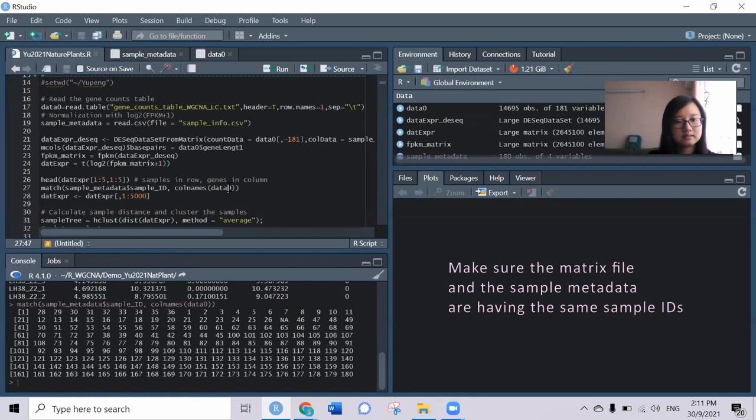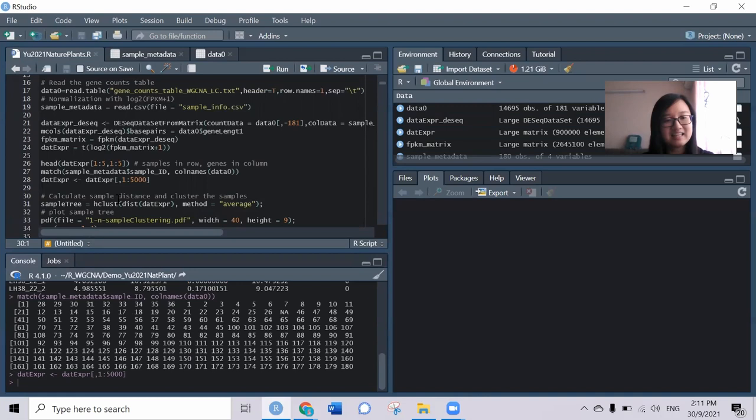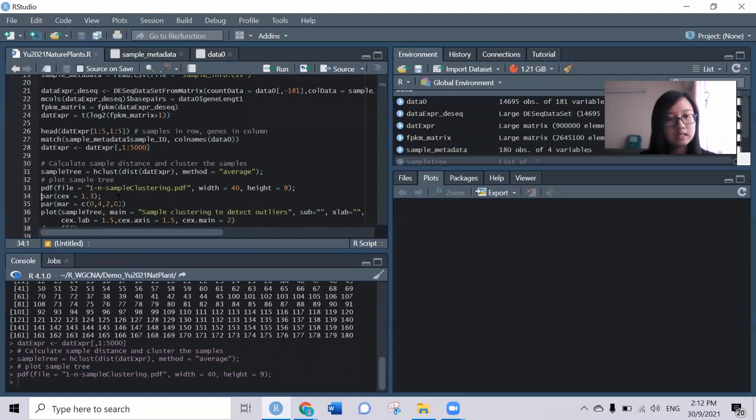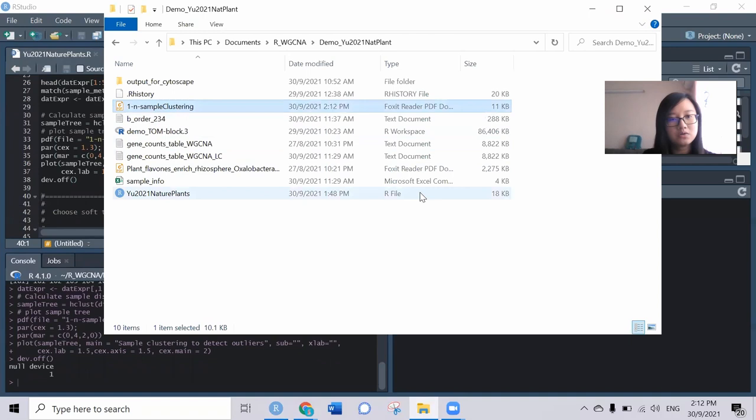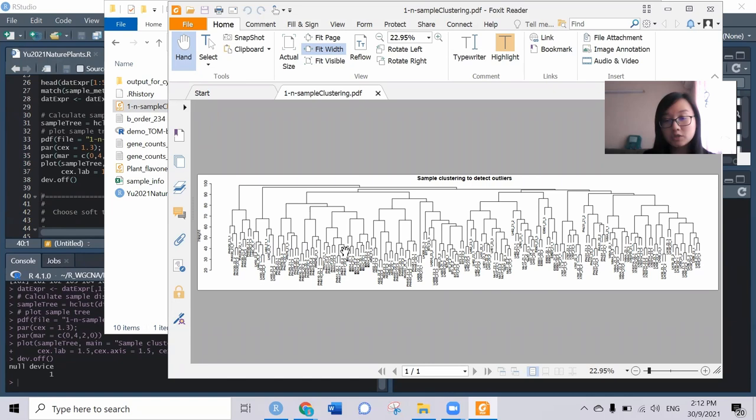For convenience, I will subset the data to the first 5,000 genes. The first thing we need to do is check whether there are any outliers in the sample. That's why they perform the sample tree to check. I've set them into my working directory file. This is the sample tree - all 180 distributed quite nicely here, so we don't need to remove any data.